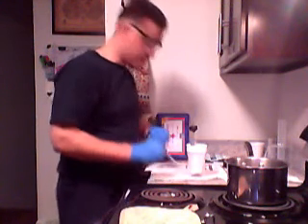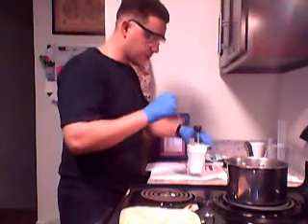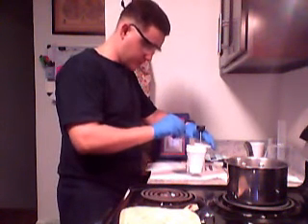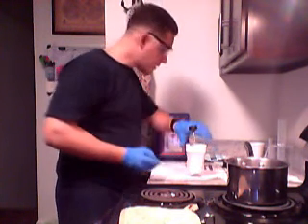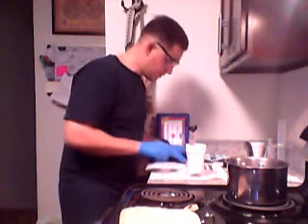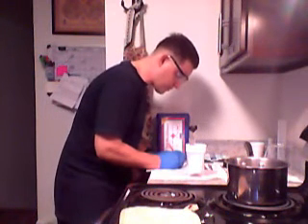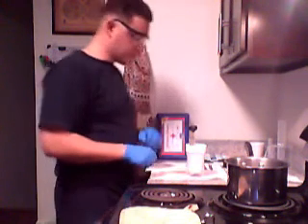Alright, about 10 seconds before the minute, so at 50 seconds I'm going to go ahead and stir. Make sure I get a good reading. Stir stick in there. Stir up the water without touching the metal. Okay, and that's 1 minute. Alright. Well, we got 23.8 degrees Celsius. Okay, going for 2 minutes.